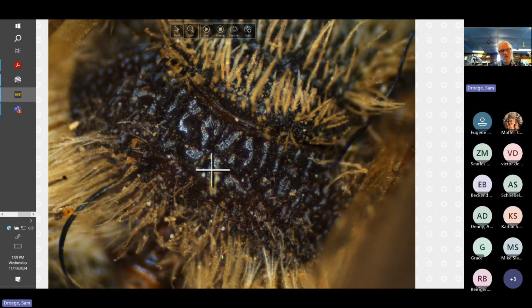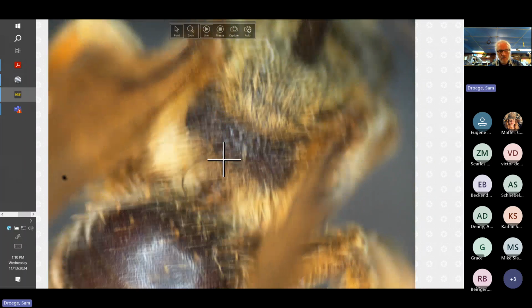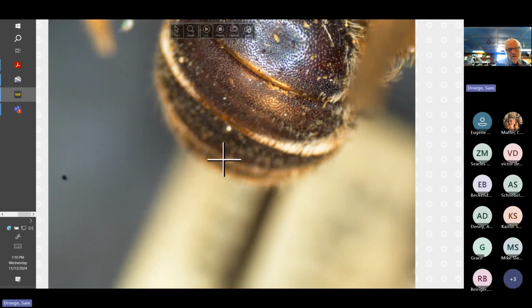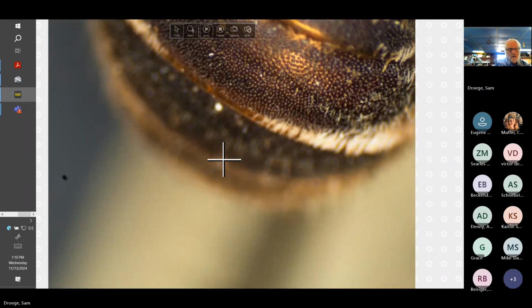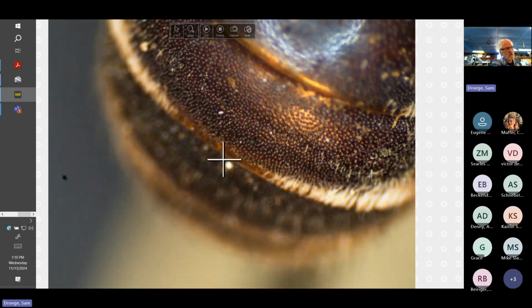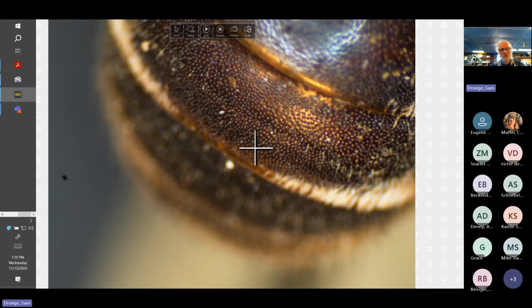Additionally, you'll see that these aren't long triangles. These are more squarish or erratic in their shape. We can look at another specimen too. So that's one, but would you take that home to your mother and ask if that's definitive and then base your entire life savings on it? Probably not. So here is T2. So this is where the other two characters that help define the species. First of all, we'll see here on T2.